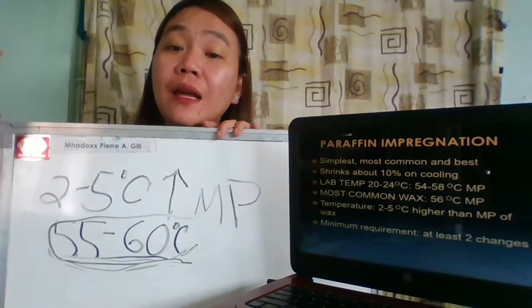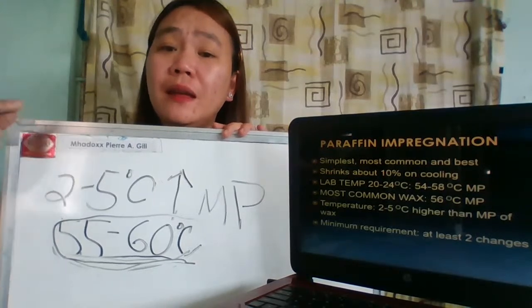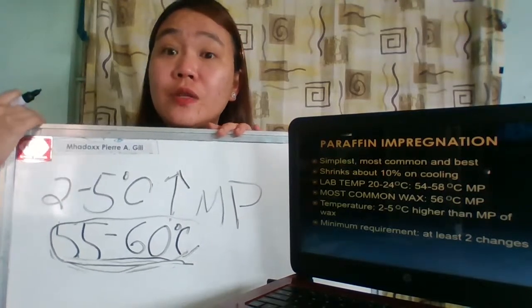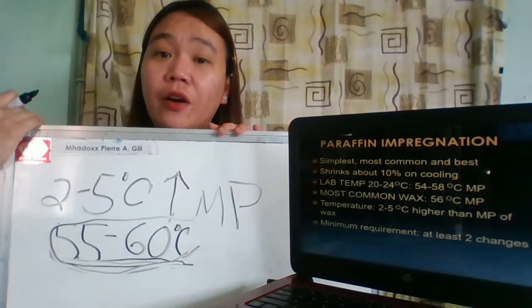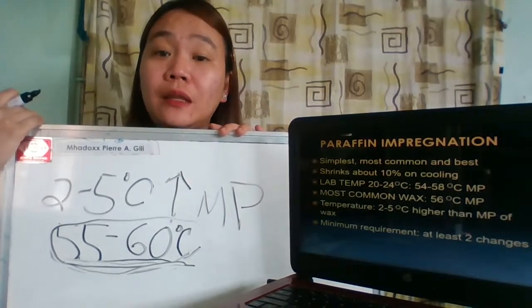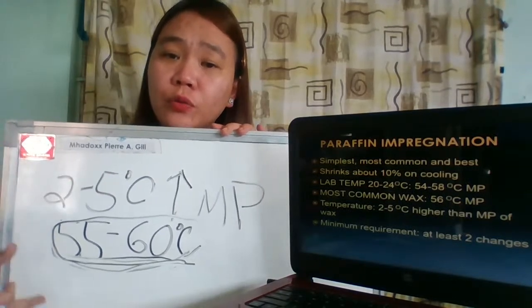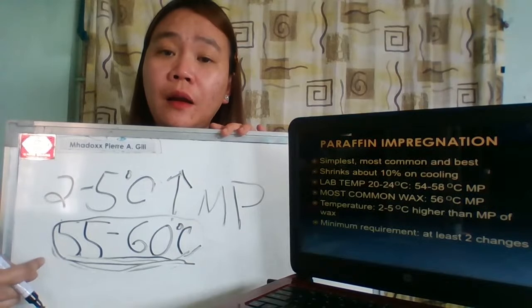Okay? It will be deleterious to the tissue sample. Anong ibig sabihin ng deleterious? So when we say deleterious, it is damaging. Okay? It will be damaging to the tissue sample. So that's why between the two, this one is better.